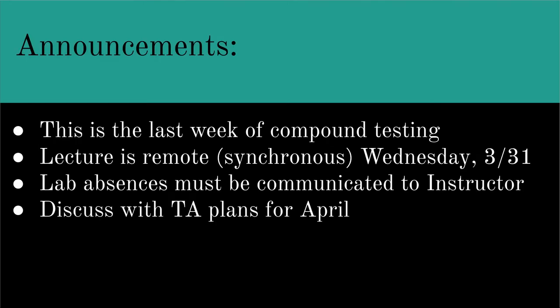Just some quick announcements to start out. This is your last week of compound testing. In other words, this is the last week when you'll be setting up vials. And every week after this, you'll be checking in on your vials to see if any are ready to be quantified. I'm going to continue to mark your vials with tape, the ones that are ready to be quantified.